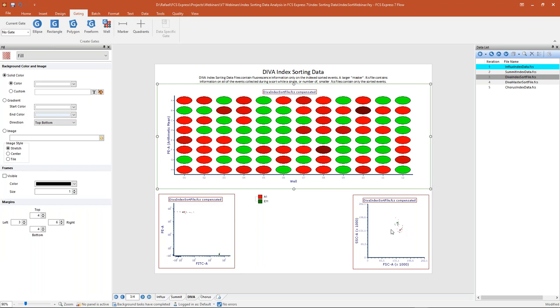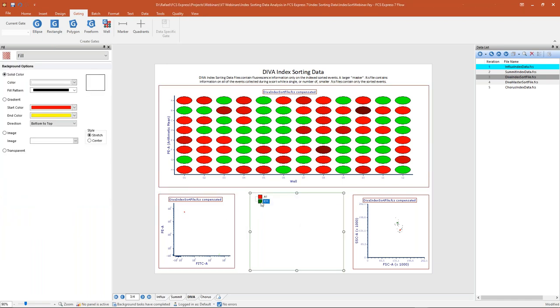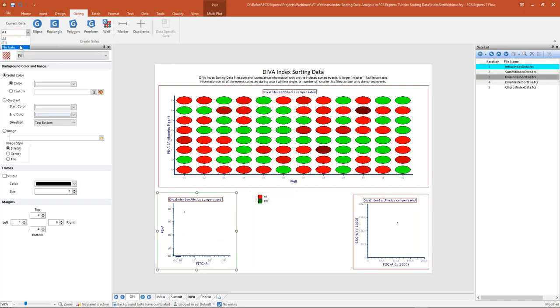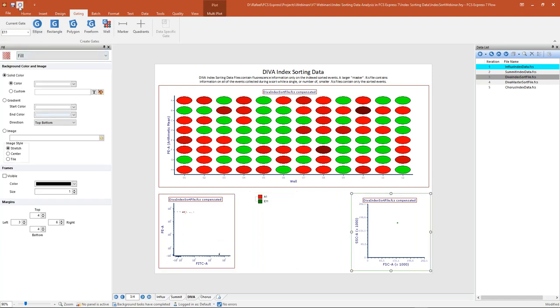Of course, we can create additional well gates to capture multiple wells or even the entire plate. Just like with our past gate examples, we can then apply those gates — in this case, our single well gates — to the plots below so that we're only looking at one sorted event. I can grab my A1 gate and drop it onto the plot to the left, and grab my E11 gate and drop it onto the plot to the right, giving us those single events plotted on each respective plot.